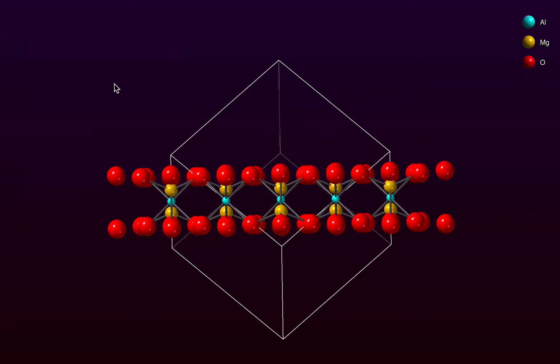Now we just have the selected atoms shown. I'm going to hide the unit cell. We have here our two layers of oxygen with the metal atoms in between.